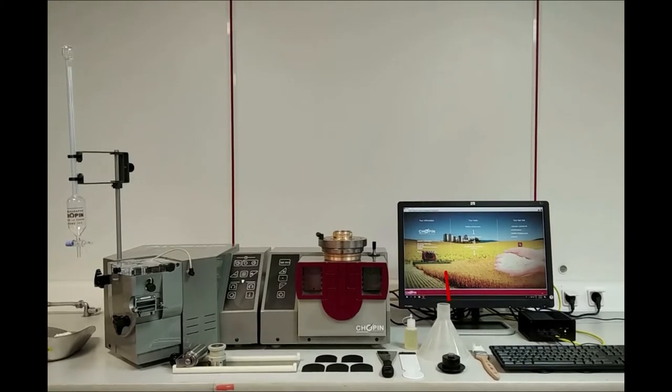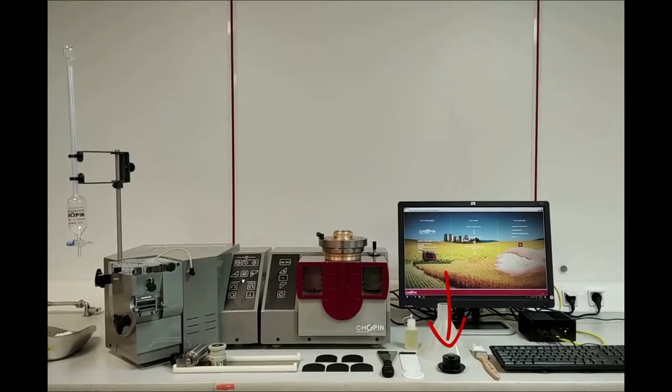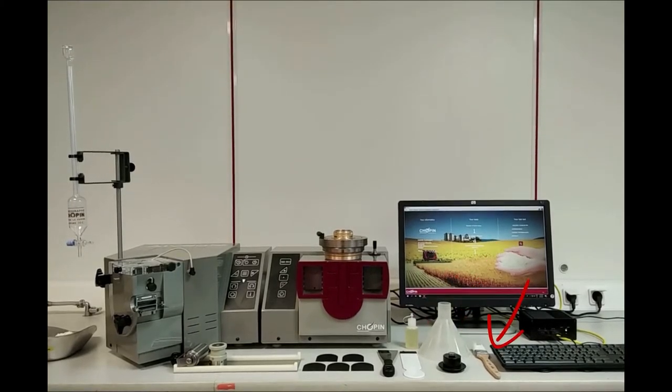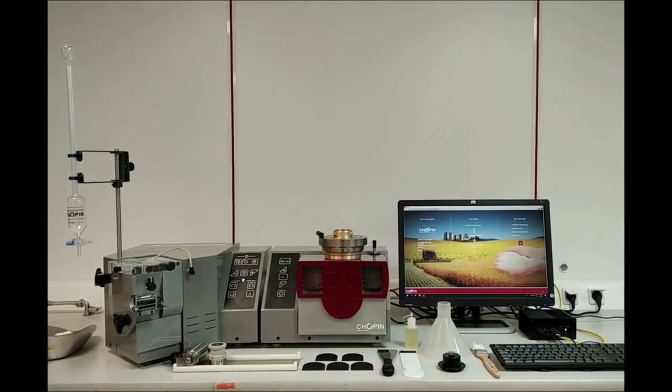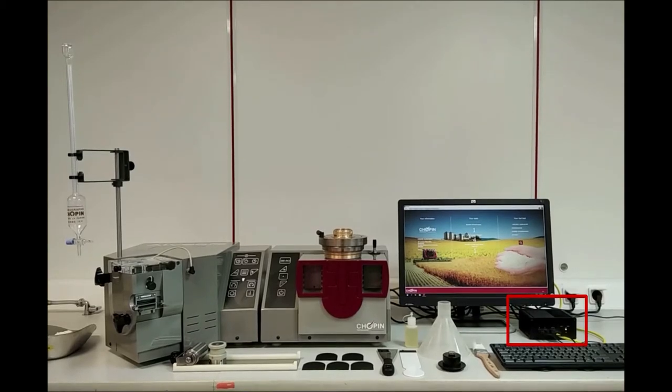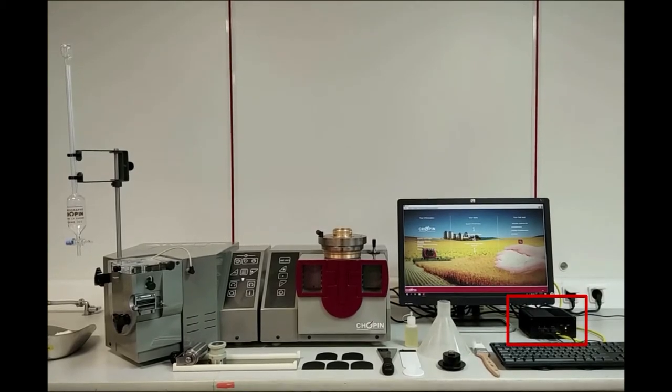It also includes a nozzle to calibrate the airflow, a feeding hopper, a brush, and a mini PC which is a central unit dedicated to run the Alveo PC.